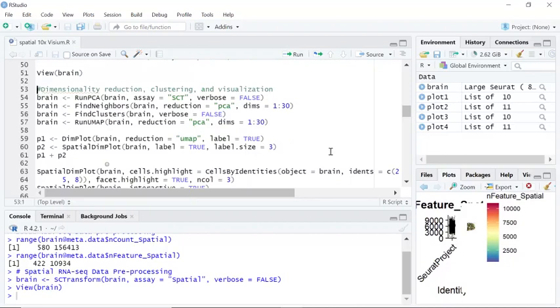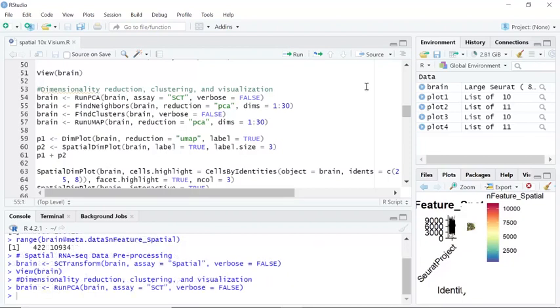After the step of preprocessing, we just need to run dimensionality reduction by the RunPCA function. Then we can find the neighbors and clusters.